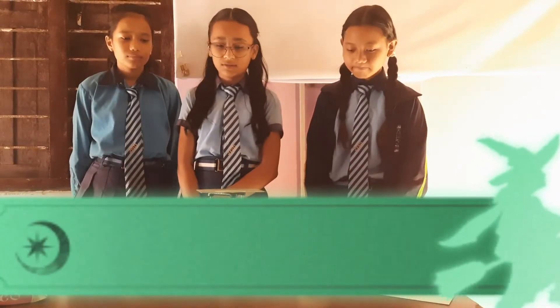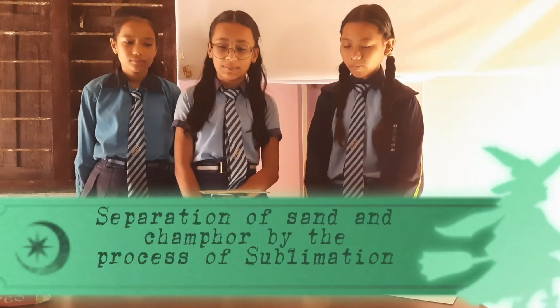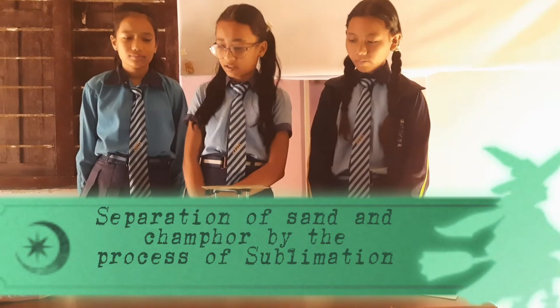Good morning. Today we are going to do an experiment of sublimation to separate sand and camphor from their mixture.